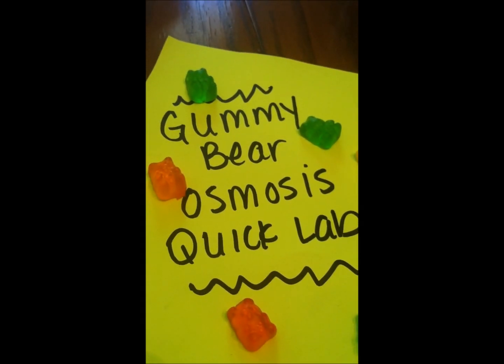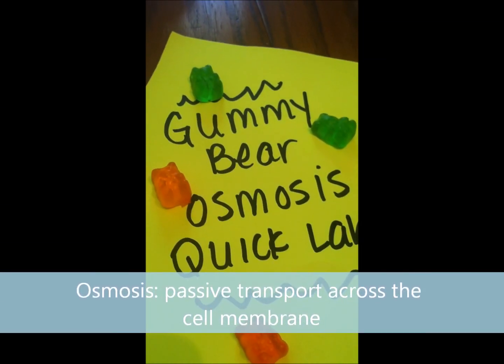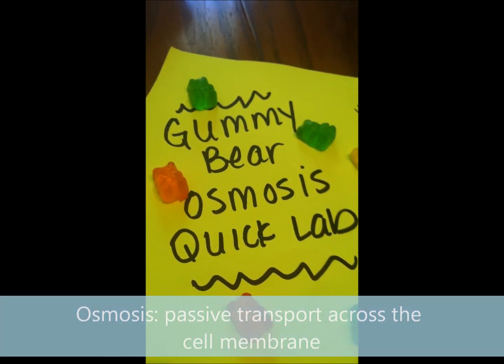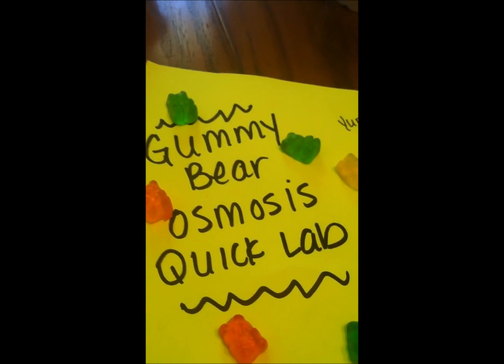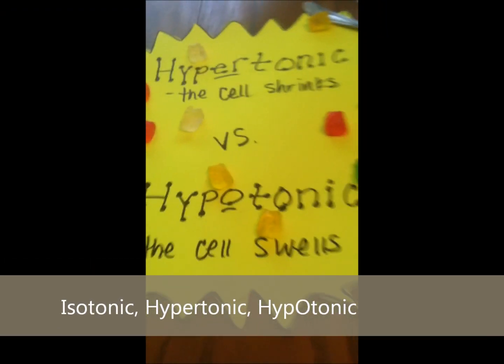Hi, we're going to do a quick demo on osmosis using the Gummy Bear Lab. Osmosis is a type of passive transport. There are two types of passive transport across the cell membrane. One is diffusion and the other is osmosis. In osmosis, there are three types of solutions. There's isotonic, hypertonic, and hypotonic.